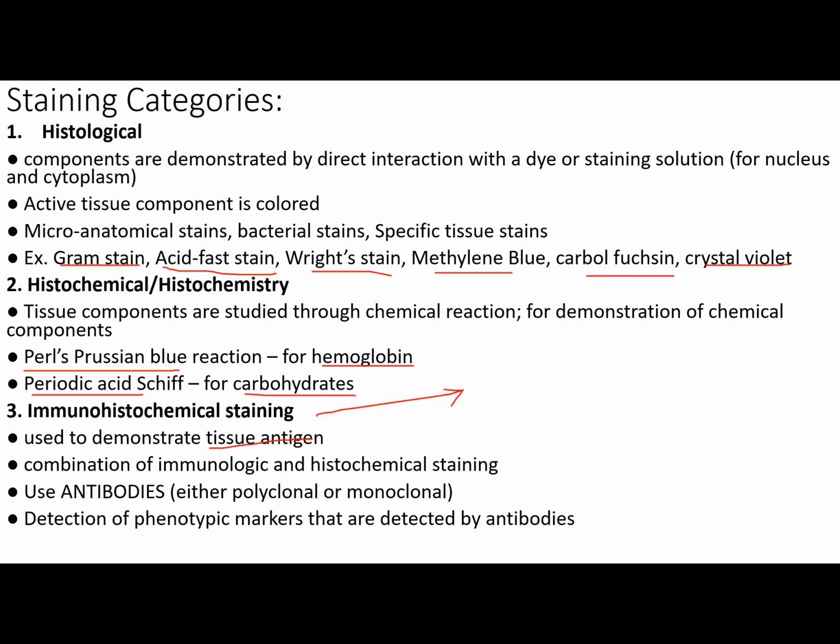This is usually used, class, for identifying specific types of viruses and fungi, and in some cases could also be used in parasitology.